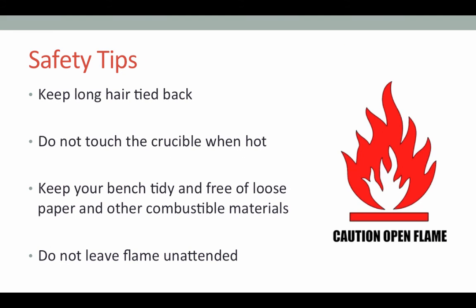Okay, and just to wrap it all up, a few safety reminders. We are using Bunsen burners in this lab, so remember, in addition to bringing your goggles and lab coats to class, make sure you have a hair tie to keep your long hair tied well back so it doesn't fall in front of your face. Also remember that the crucibles will remain hot long after you've turned off your Bunsen burner. So when you're waiting to see if they've cooled, do not touch the crucible directly, but instead use a piece of paper towel to gently grasp the crucible to see if it's cool enough to handle.